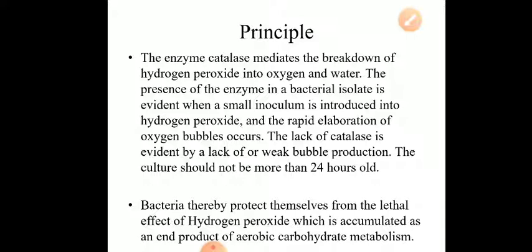Okay, so if you are given a test organism or a test isolate and you are asked whether the organism produces catalase enzyme or not, what will we do?